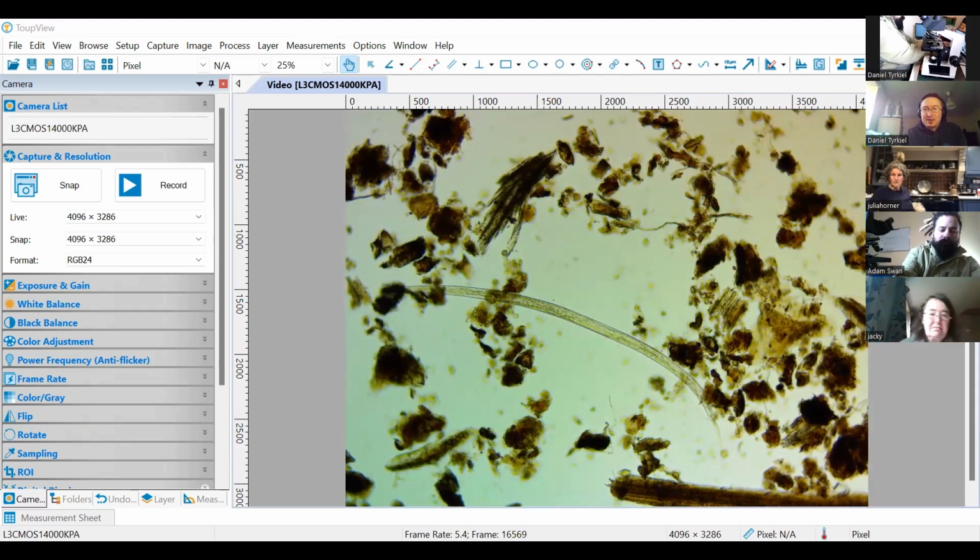There are obviously other methods to assessing numbers of nematodes very accurately. You can use the Baermann funnel method, which basically extracts 99% of all of the nematodes from the sample, and you take like 50 milliliters of the sample to do that. But then you need a different microscope, which actually looks from the bottom of a petri dish.